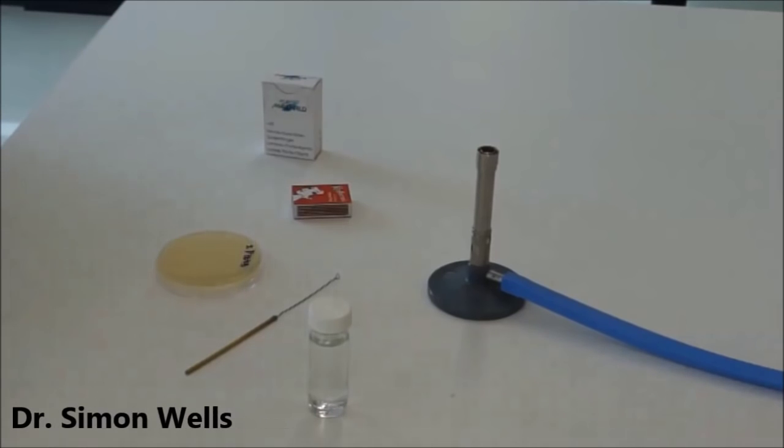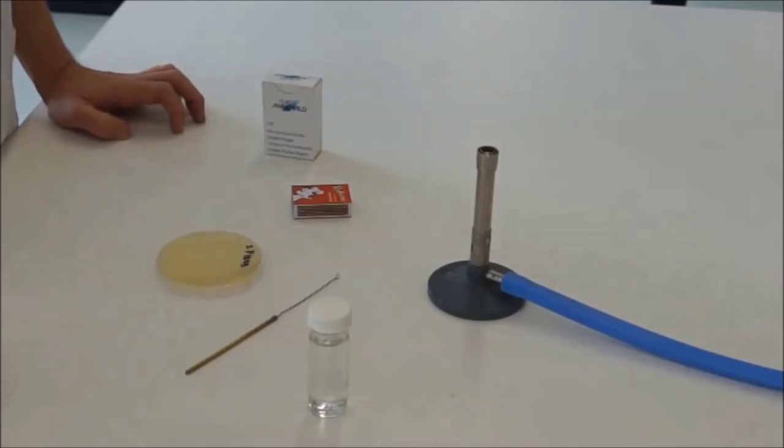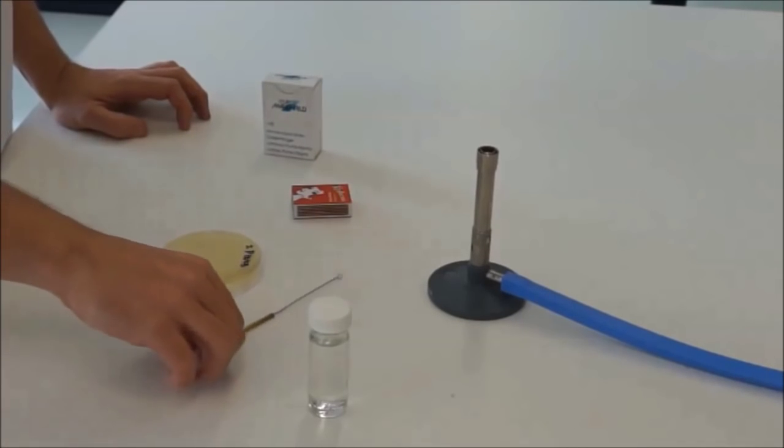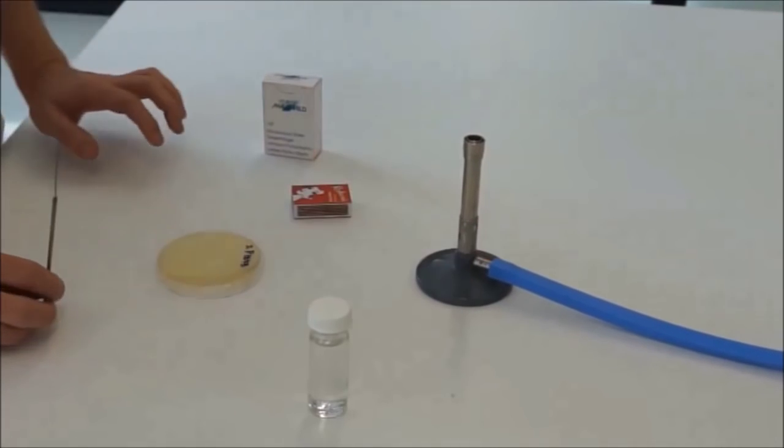Now I'm going to show you how to make a heat-fixed bacterial slide that you can then process for gram staining. It's important that you use aseptic techniques, so that means that the bacterial colonies that you're using are as pure as possible, and that means usually heat-killing any other bacteria or impure bacteria that are on your loop or anything you've transferred. So we're going to be using a Bunsen flame today.